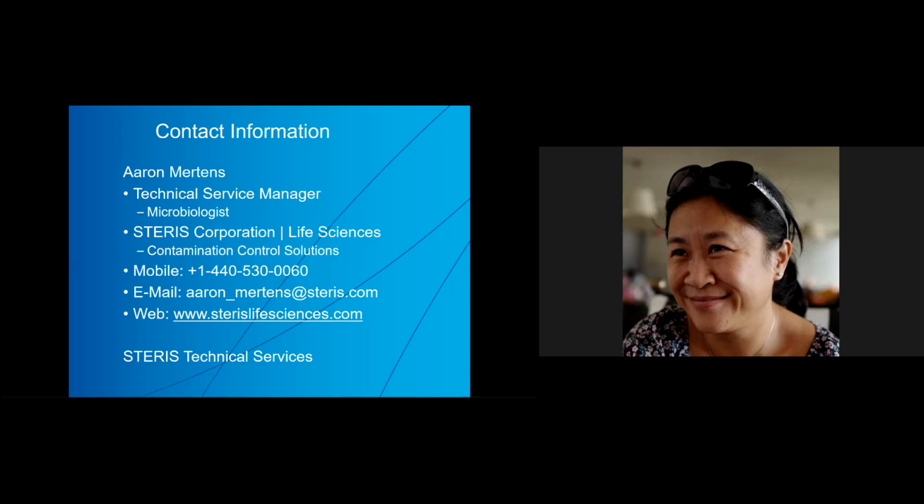Thank you. We have the next question from Sim. Do we perform half cycle method validation for steam sterilizer?